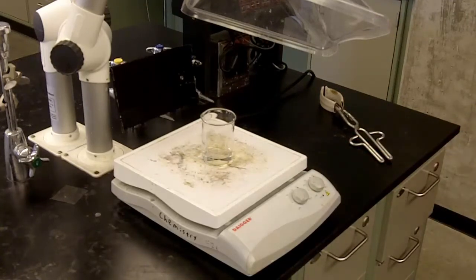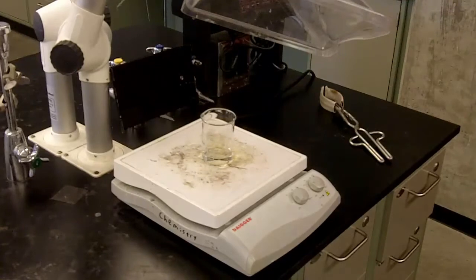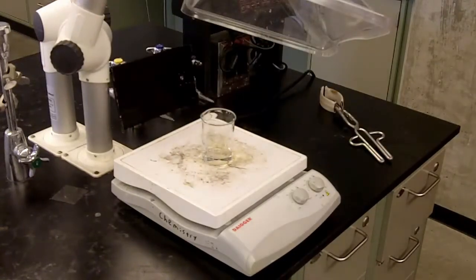Now, one thing you have to be very aware of with HCl is it has a boiling point of about 100 degrees. So once you heat it up basically to boiling water or 100 degrees, it will start to vaporize. That gas is dangerous, and because of that, we have a fume hood over top of our beaker, and that will capture the gas and allow us to safely remove it from the environment. So we'll turn on the fume hood, and now that we're heating it, we're going to let it heat up briefly, and we'll continue on.